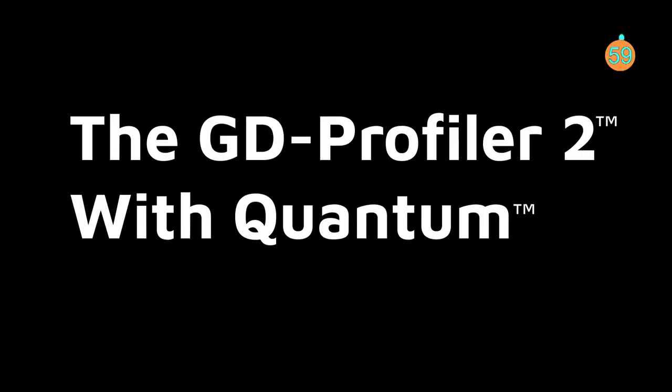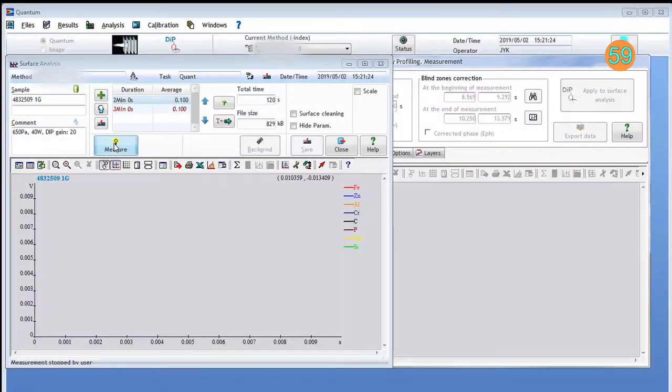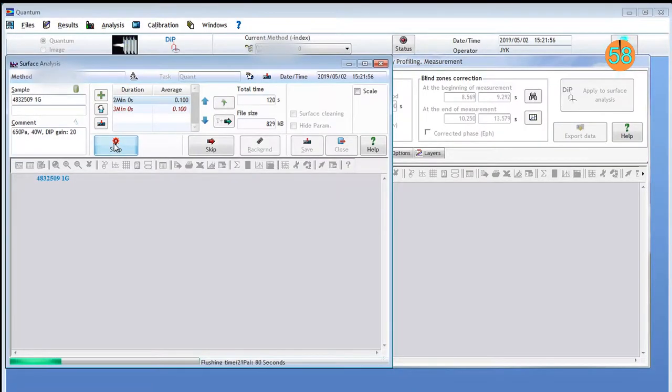The GD Profiler 2, powered by Hariba's Quantum software, offers data acquisition and post-analysis capabilities.